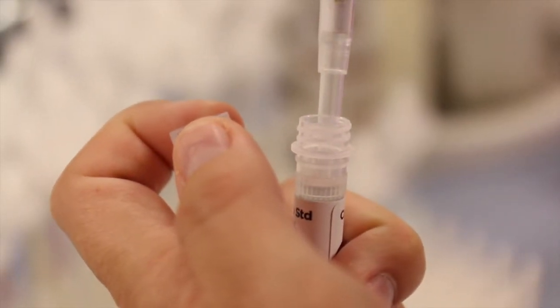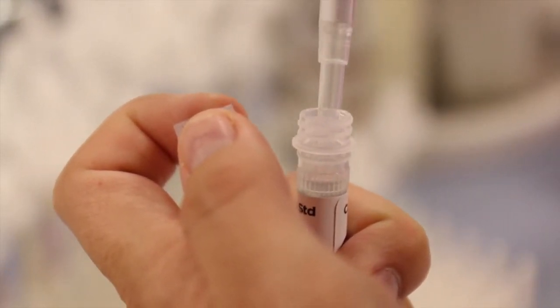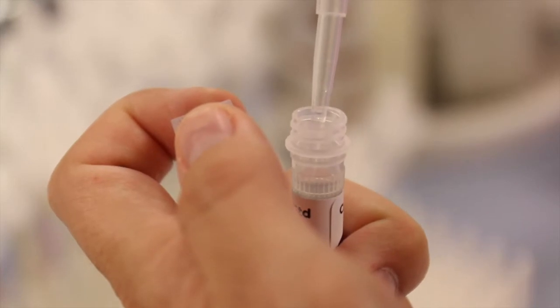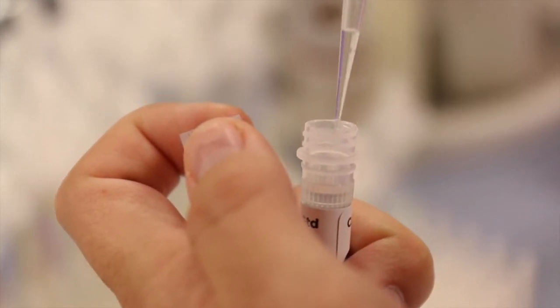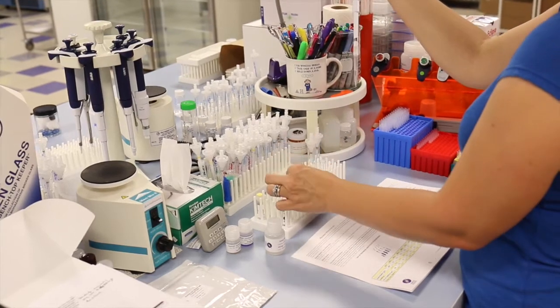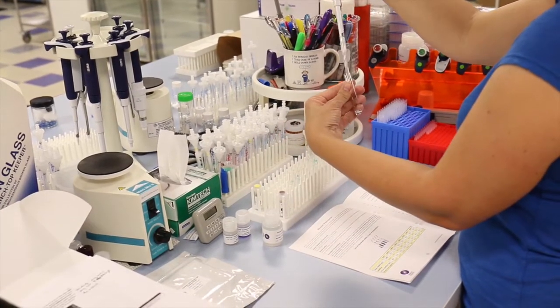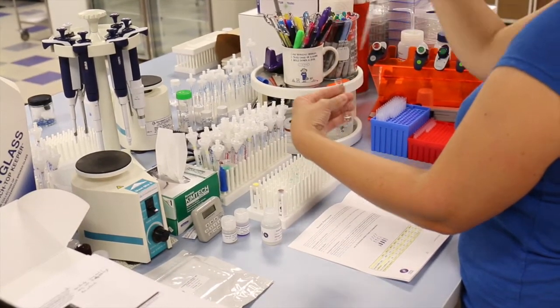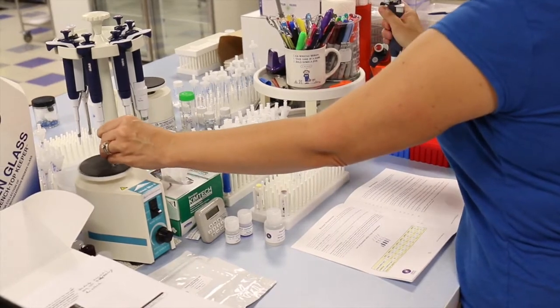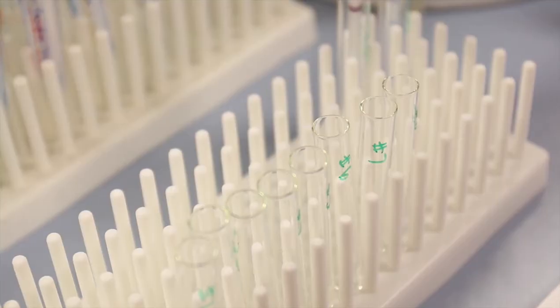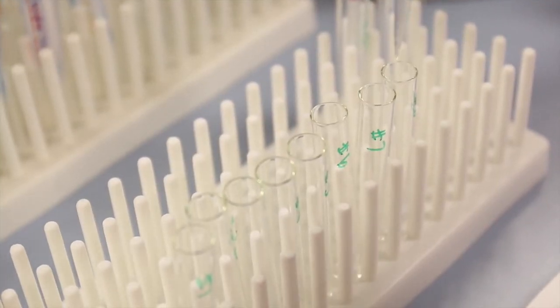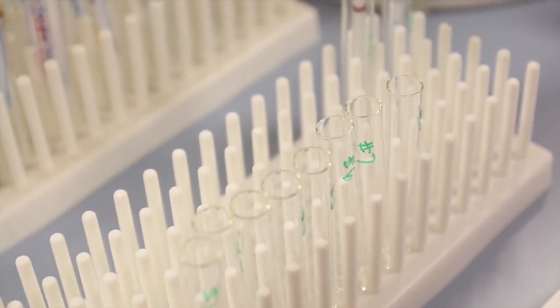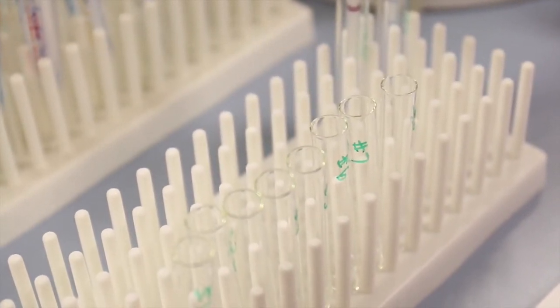Standards may contain organic solvents to stabilize the molecule. Ensure that you fully equilibrate the pipette prior to pipetting the stock. Read the instructions that came with your pipettes for pipetting organic solvents. Continue to prepare standards as described in the kit protocol.